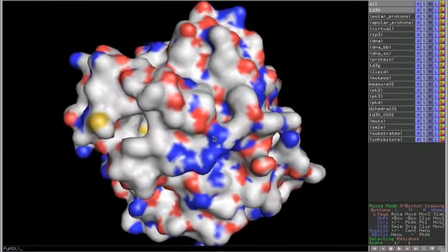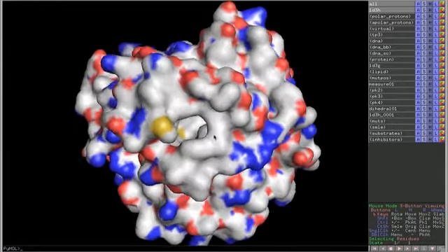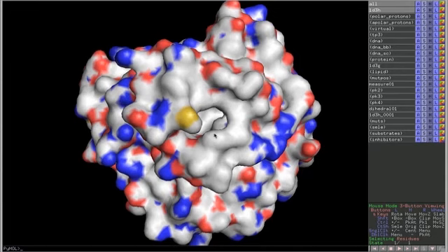And one other thing that's important about this enzyme is that it's an enzyme, so it operates on small molecules, on ligands, and we can actually show them too. This is the fun thing about going into a protein structure, trying to see all the different moving parts. So let's show these cofactors, or ligands, as they're called. Let's show them as sticks. These would be the things that the enzyme is operating on.